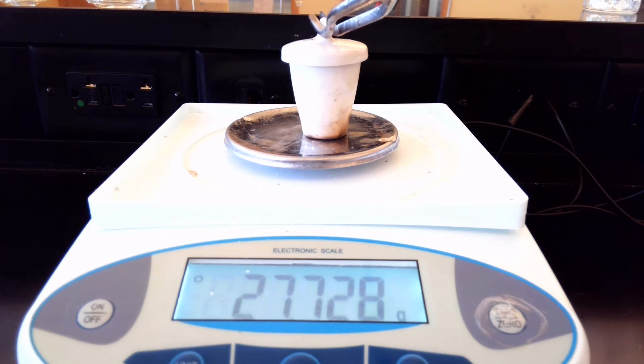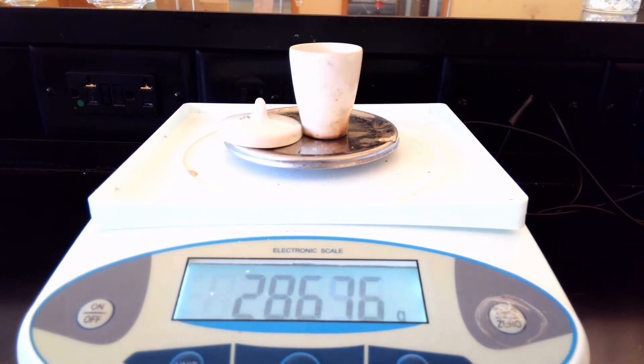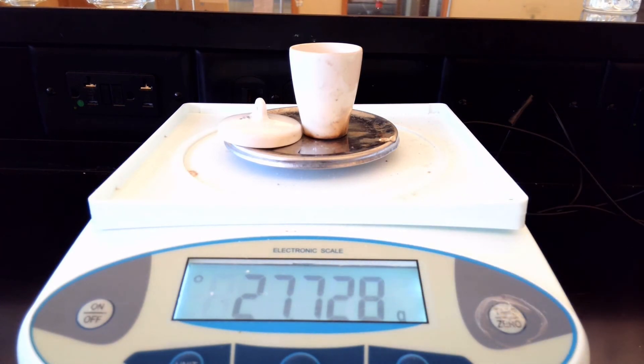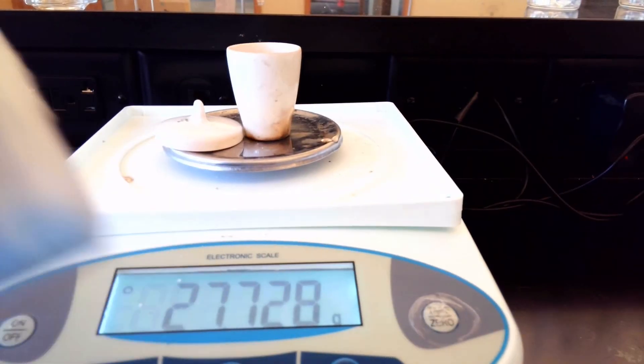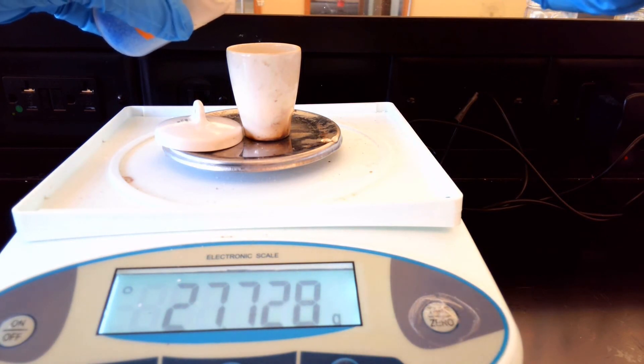We're going to remove the lid just briefly and put it on the side. Now we're going to add in our unknown. We still have the same crucible mass of 27.728 grams, and we want no more than 3 grams of sample, so we're shooting to get around 30 grams total. We're going to take our unknown metal — this is our hydrated salt — and put it in a little bit at a time.